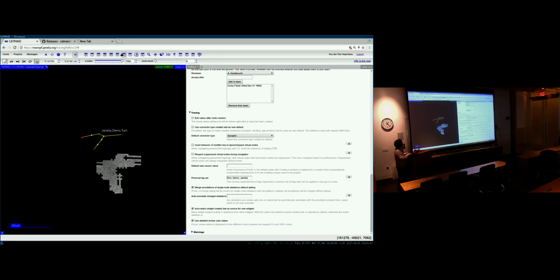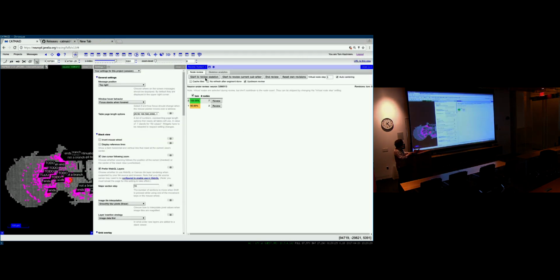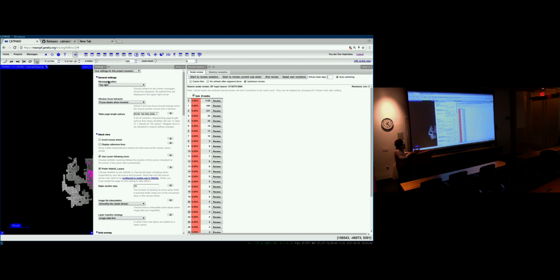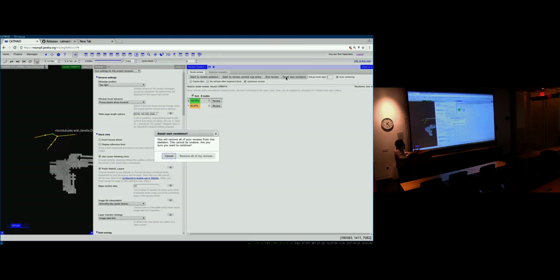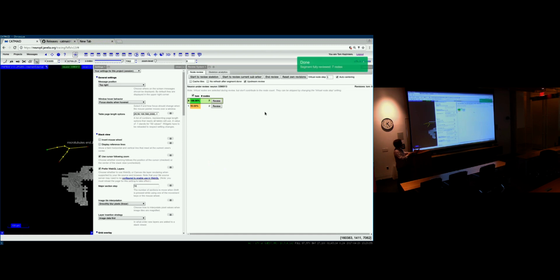And if you, let me maybe select some random neuron. Oh, still the old one selected. Okay, I guess that's a bad example. Let's stick to the one ahead here. Okay, so now as I move through this, the color gets brighter and brighter until it hits green, right?